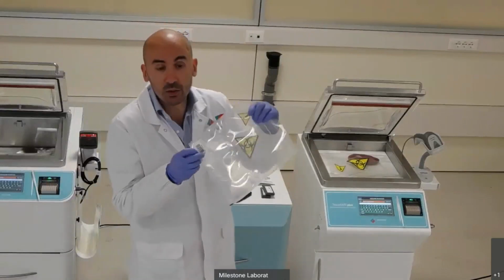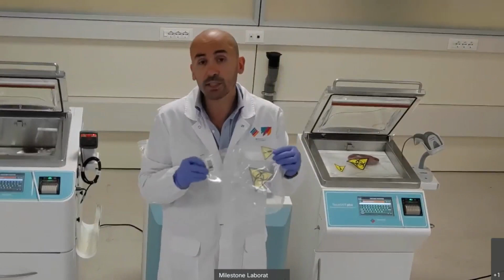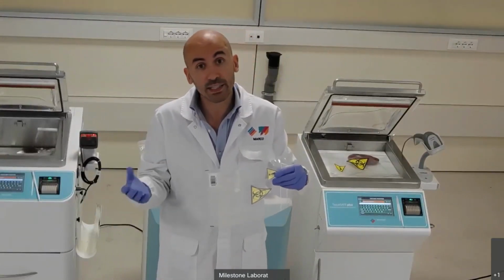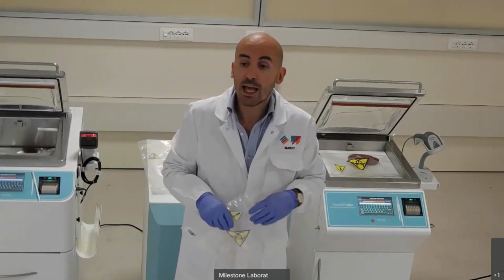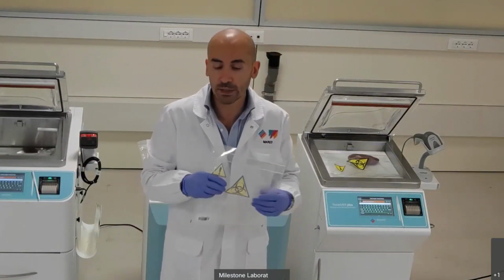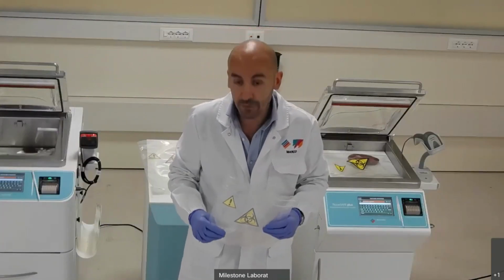On each bag, you do have a unique barcode. On this barcode, you do have information about the bag size and how many times this bag has been used. After a procedure, like the one I will perform in a few moments, I will have an association between the identification code of the bag and the identification of the patient.